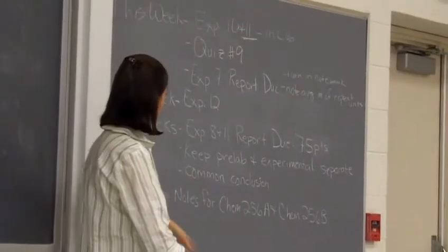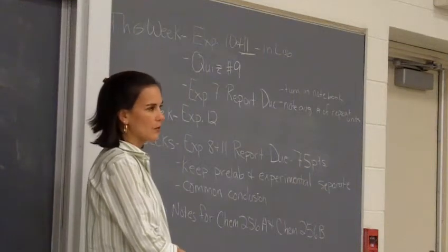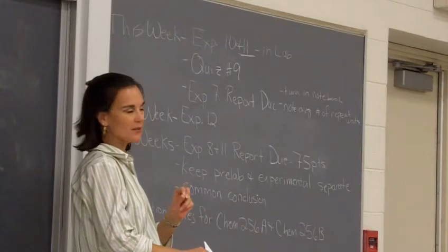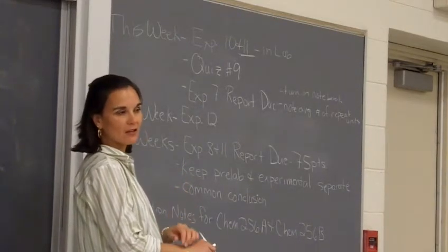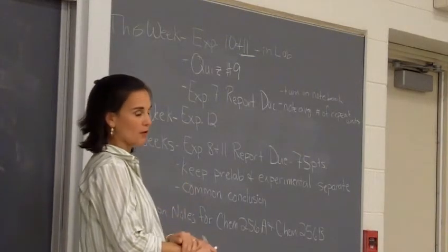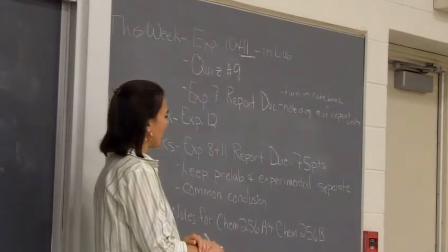Announcements real quick, and then a couple of notes here for registration as well. So this week in lab, we're going to be doing experiment 10 and 11, which is what is on your syllabus. The actual doing, for the most part, is experiment 11. Experiment 10 tells you about gas chromatography, which we're going to go through here in a little bit. But the actual doing is in experiment 11.